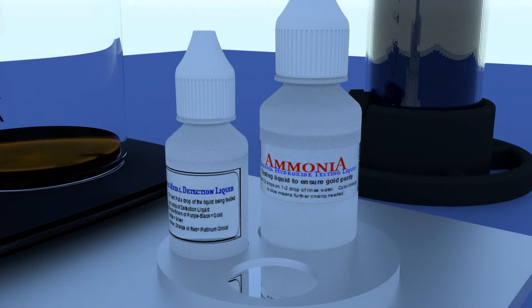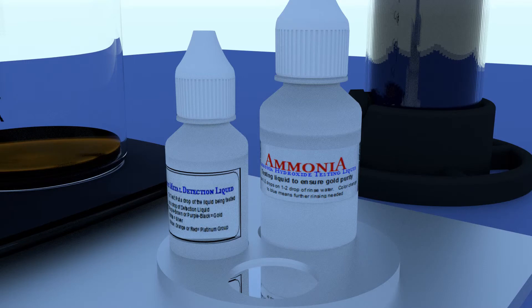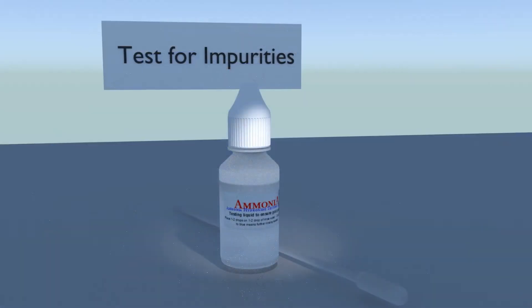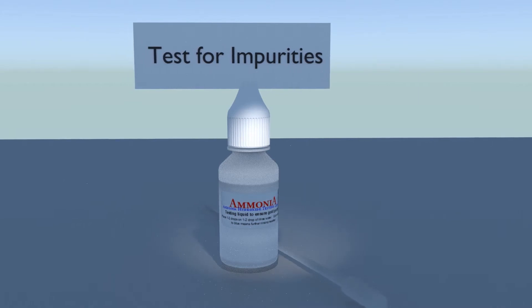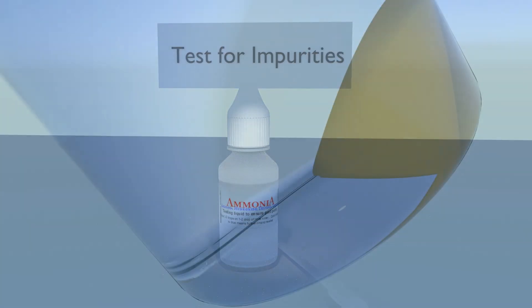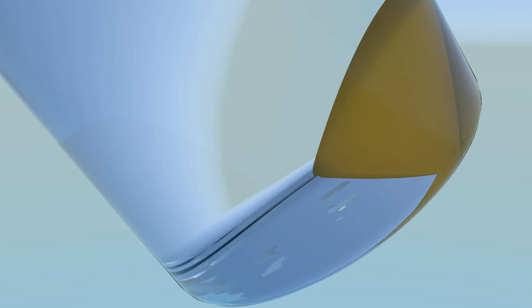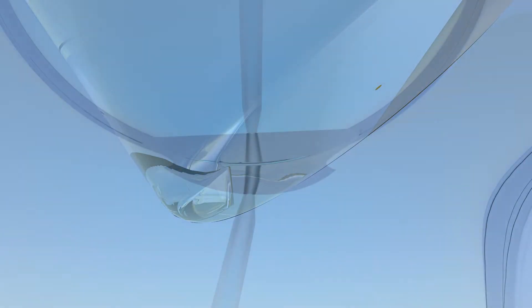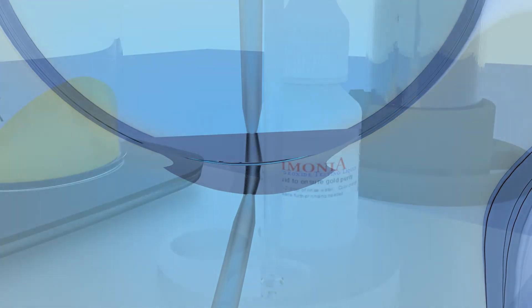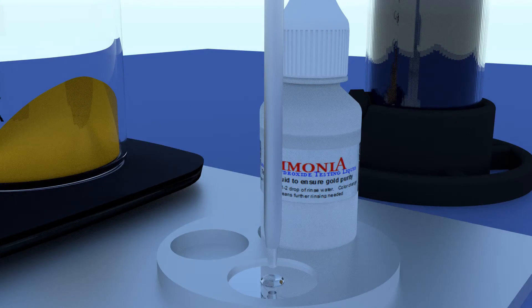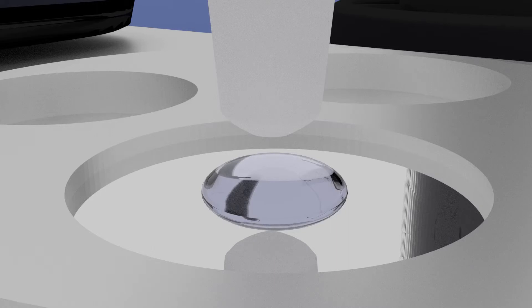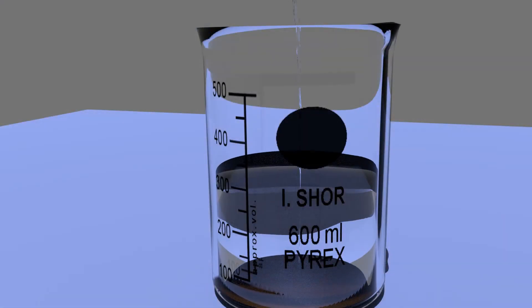The test for impurities is very similar to the test for dissolved gold and it has a similar degree of sensitivity: four parts impurities per million parts of solution. This test however uses aqua ammonia test solution. Tilt your beaker so that the small amount of water clinging to the mud rolls down to form a small puddle in the corner of the beaker. Using the pipette, take a sample of the water and place a drop or two on the spot plate. Now add a drop or two of ammonia test liquid. Any change to blue, even the palest shade of blue, indicates impurities and another rinse is required.